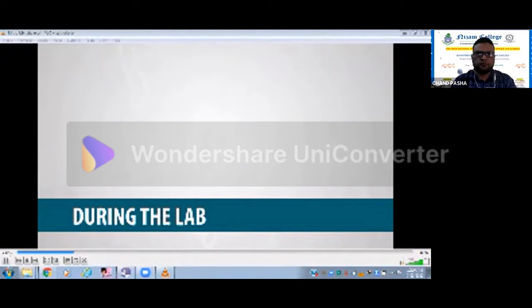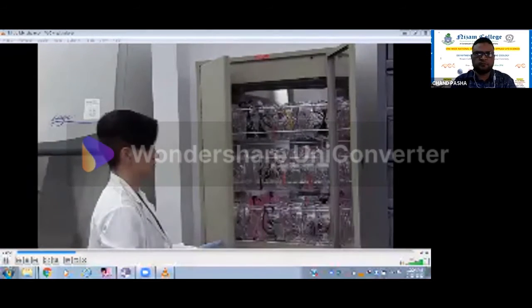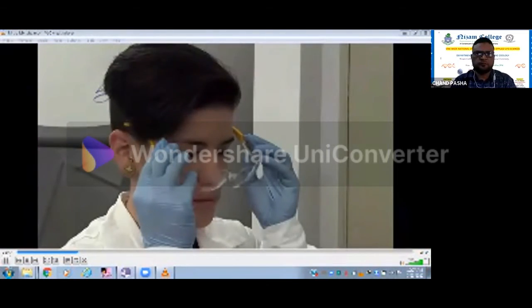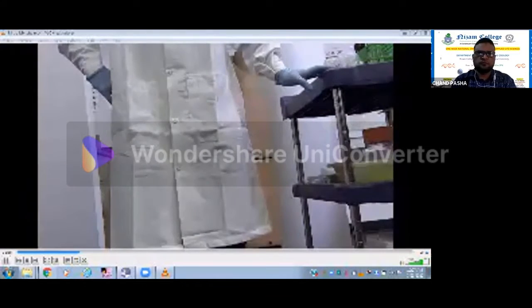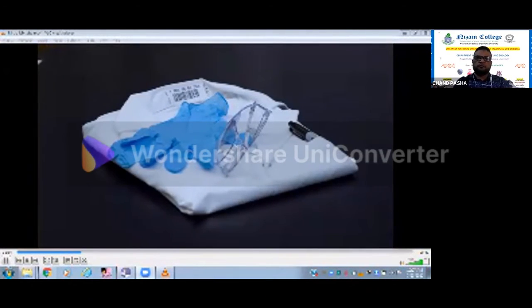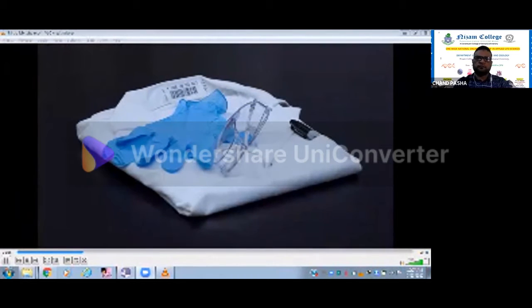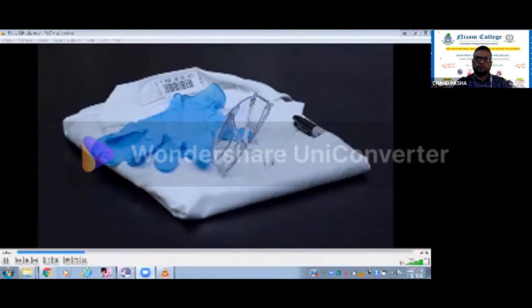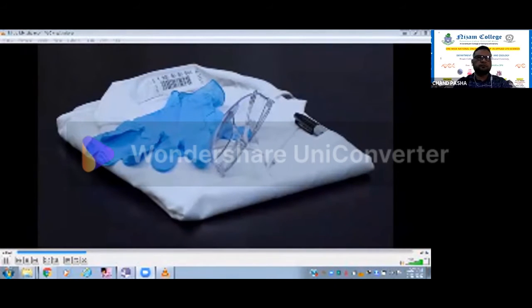During the lab. Always wear a lab coat, gloves, and safety goggles while working in the lab. The lab coat should only be used during lab and should remain in the lab. Even discounting potential biohazards, a lab coat will protect your clothing. There is a reason many of the chemicals you will be working with are called stains.